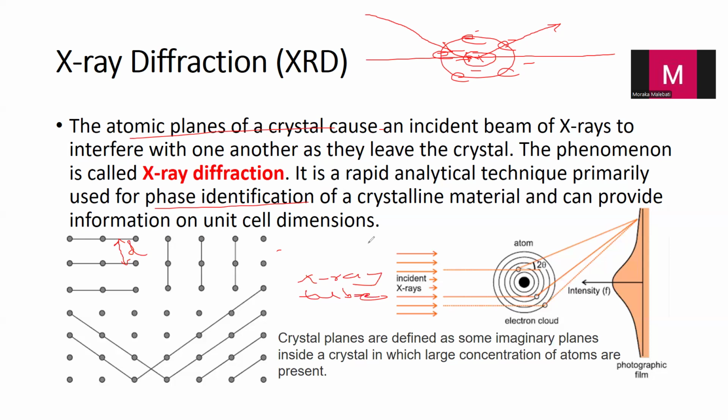The moment the X-ray tube provides us with the X-ray beams, they are collimated X-ray beams. When we say something is a collimated X-ray beam, it means an X-ray beam that has been made to travel in parallel lines.